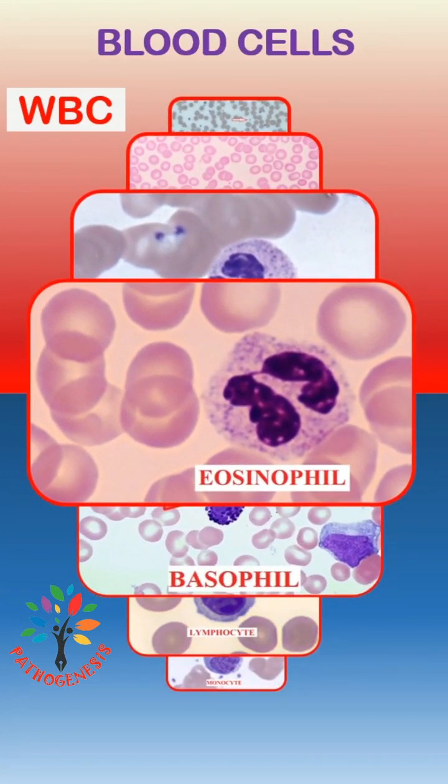Eosinophil is also a granulocyte having two nuclear lobes. It has thick red staining granules in the cytoplasm.